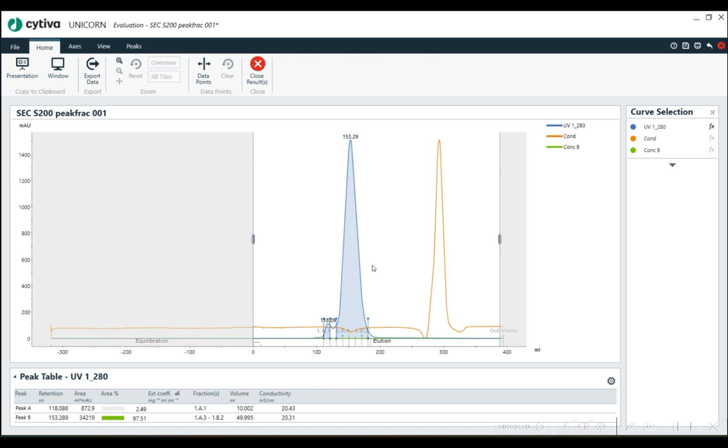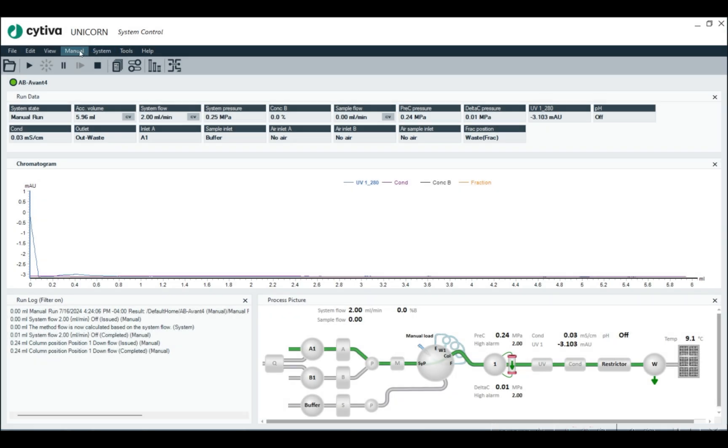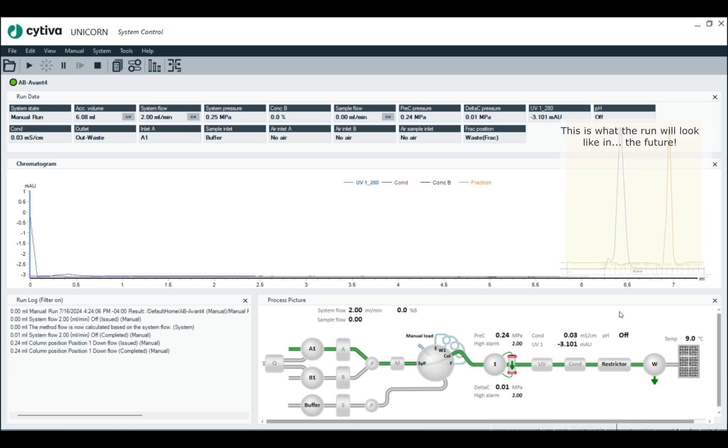I'm going to show you how you set this up, both in the manual mode, and also in the method editor. So first in manual.